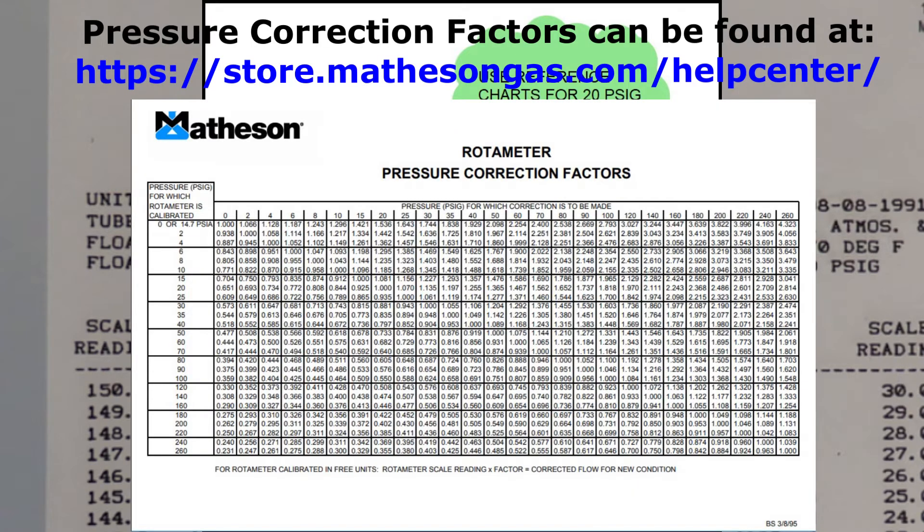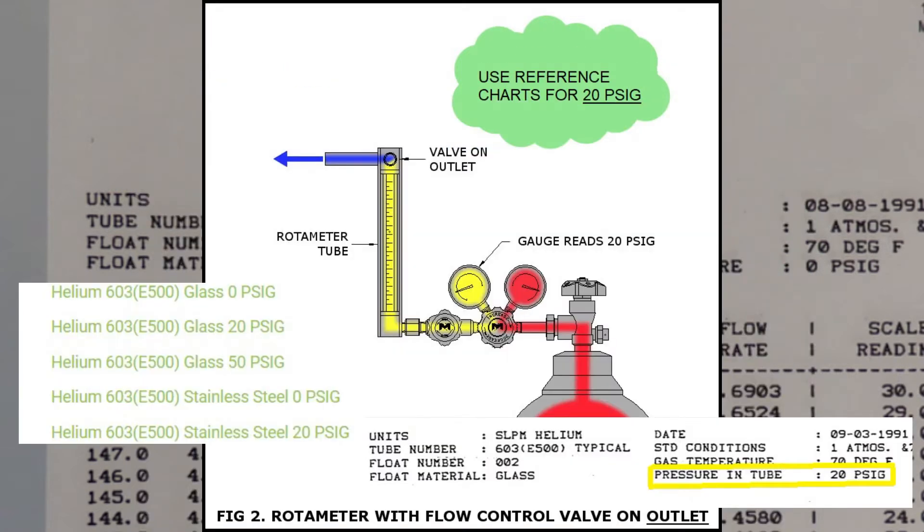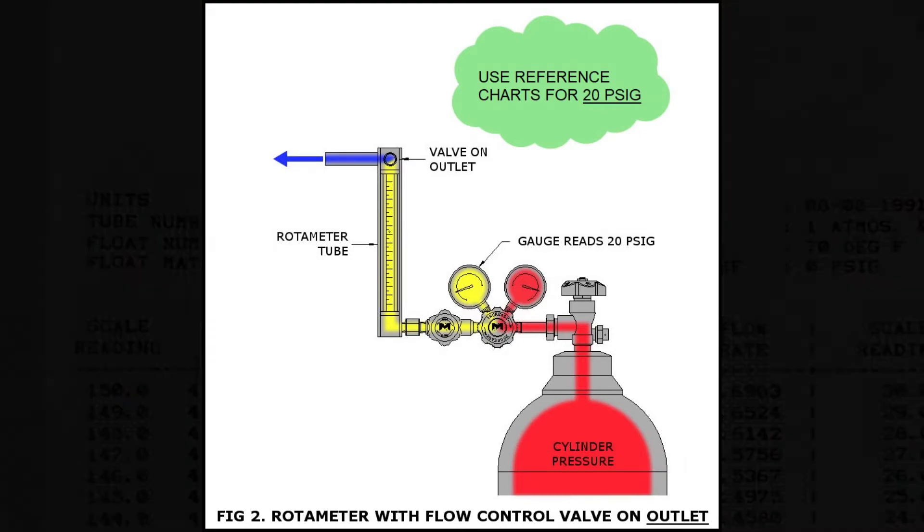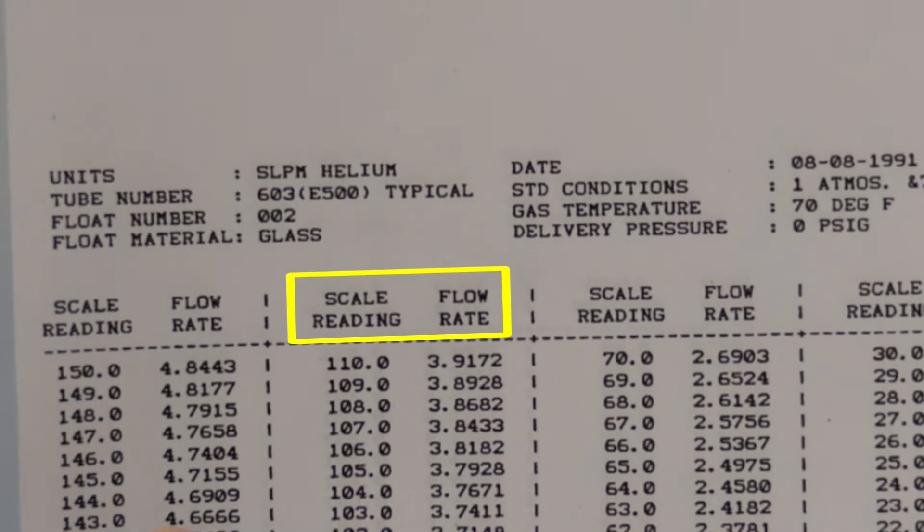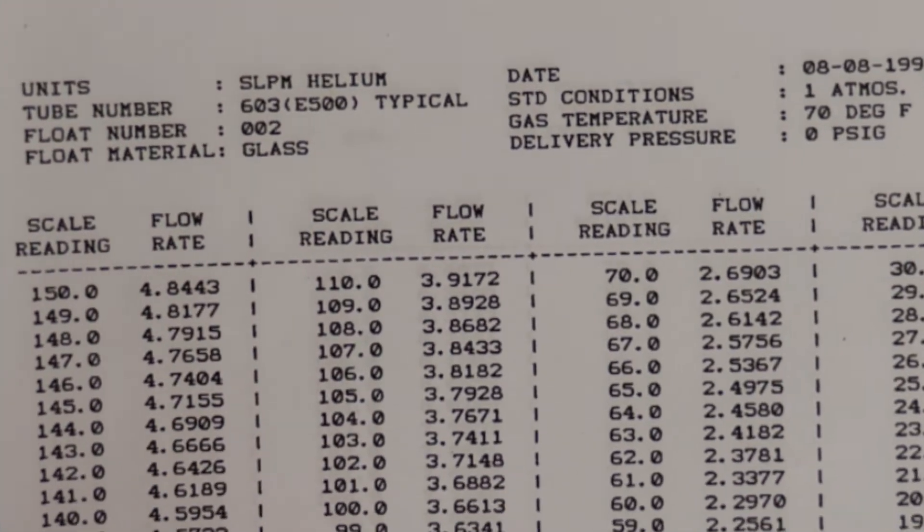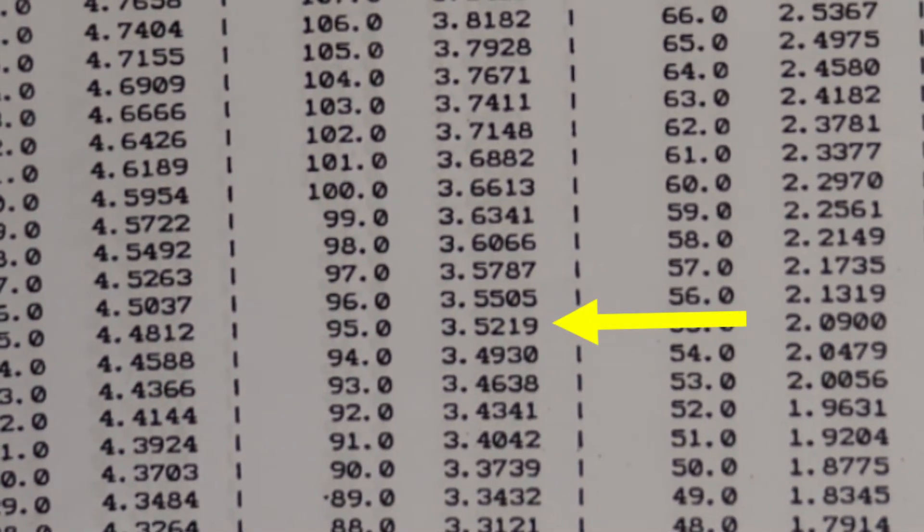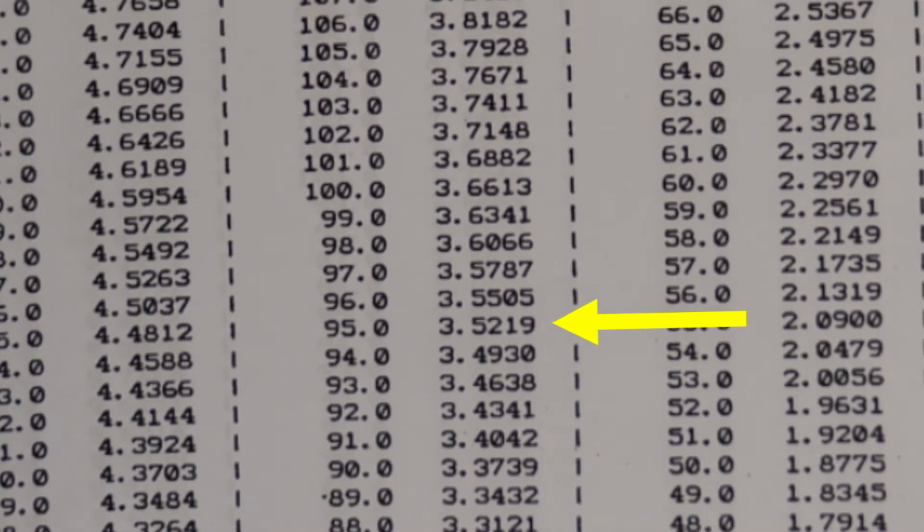So we'll locate 95 under the scale reading, 95 millimeters. We can see that it corresponds with 3.5219 standard liters per minute helium.